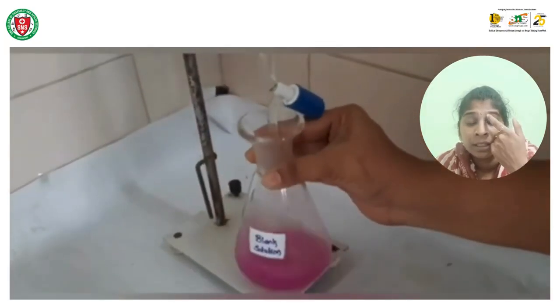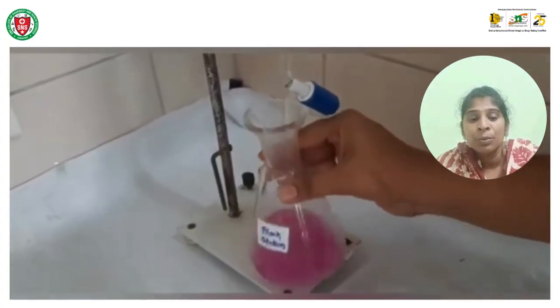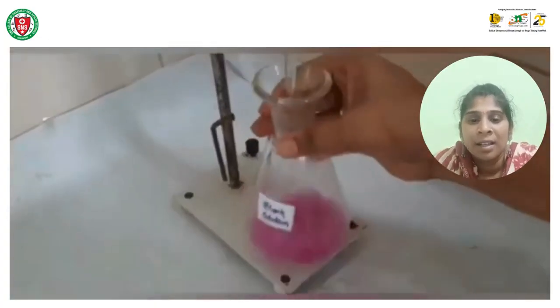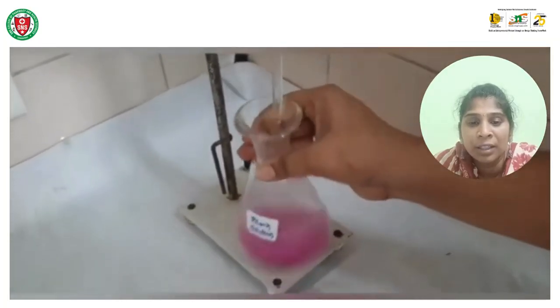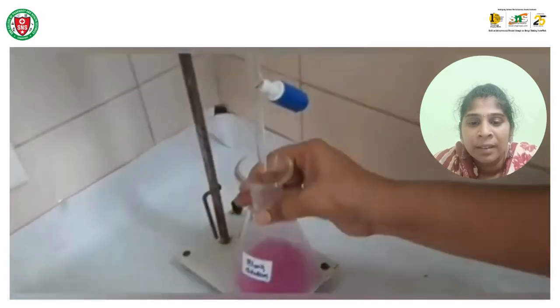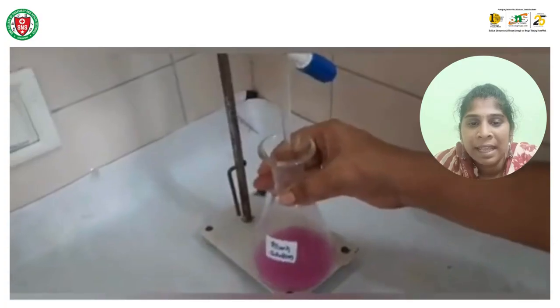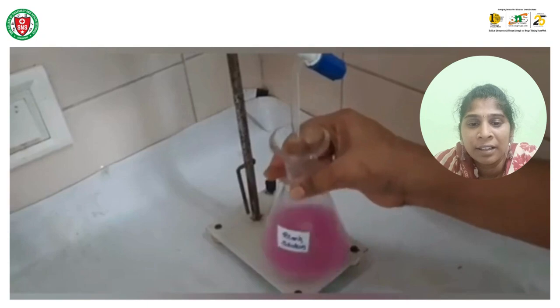After taking both the readings, we need to calculate with the formula. The blank is also turning from pink to colorless. Slight changes are there, I hope everyone sees.